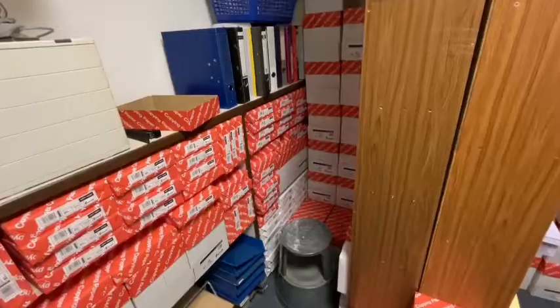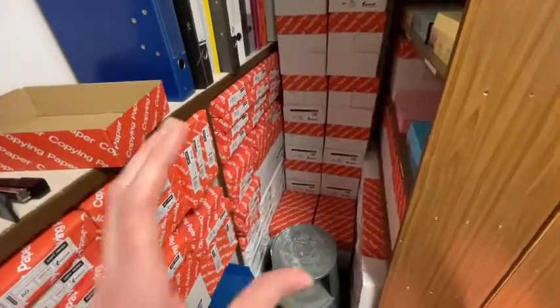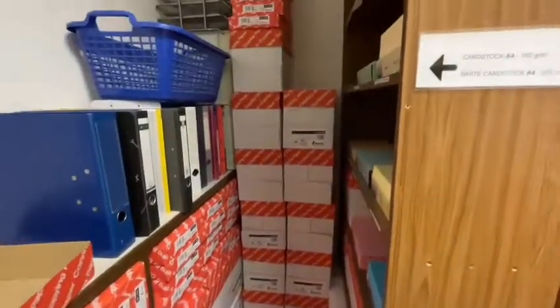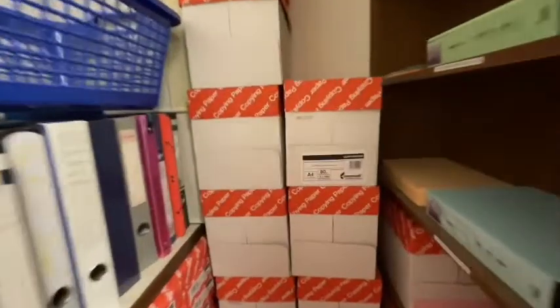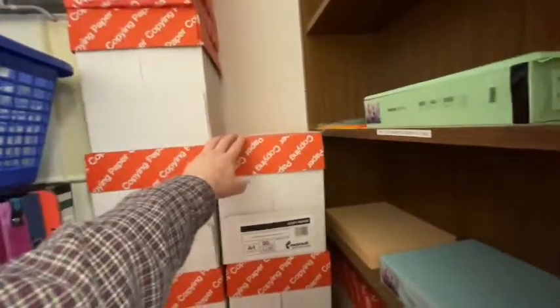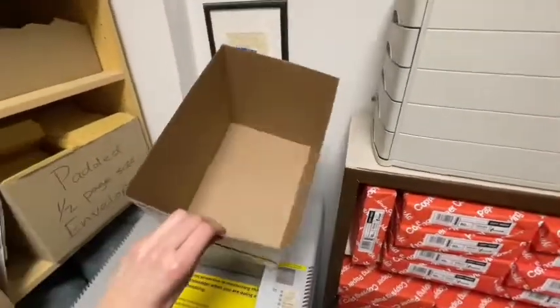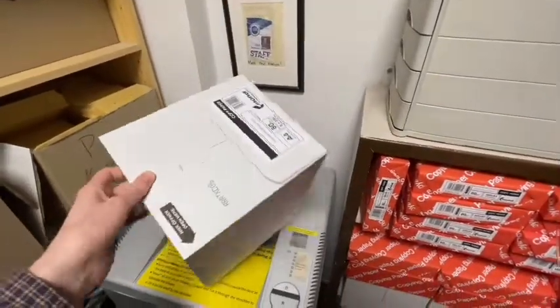So where do we get the setup for the dark experiment? How are we going to put the leaves in the dark? I found the best way to simulate the dark is to use copier boxes as the cover. So I just come into the supply closet, and when nobody's looking, I take a bunch of these boxes. After you take out the copy paper from the boxes, I'll just get one of the boxes like this.